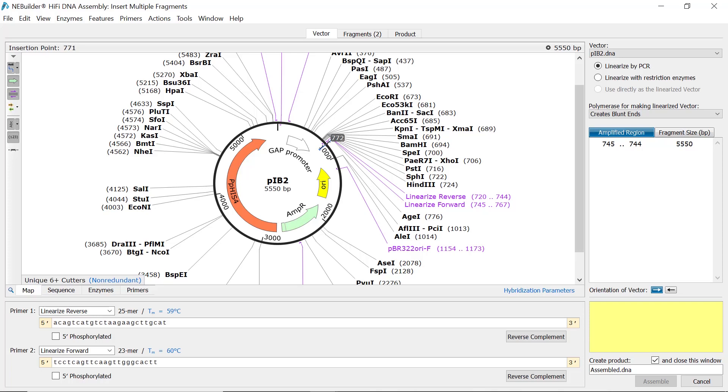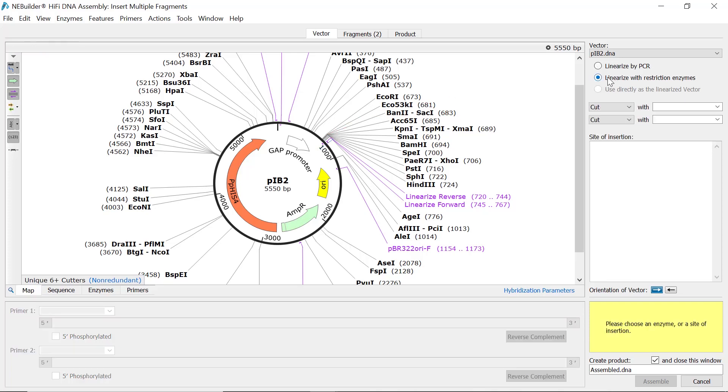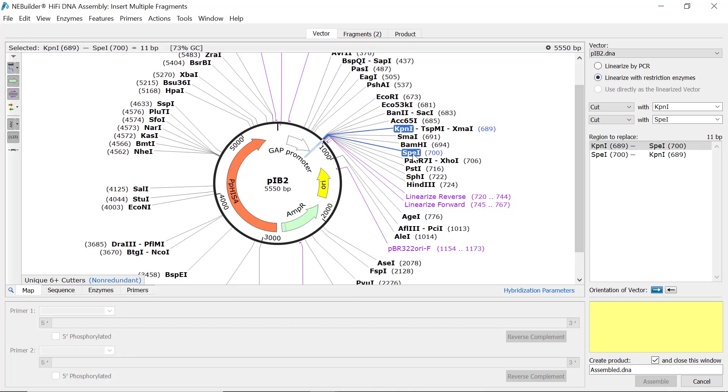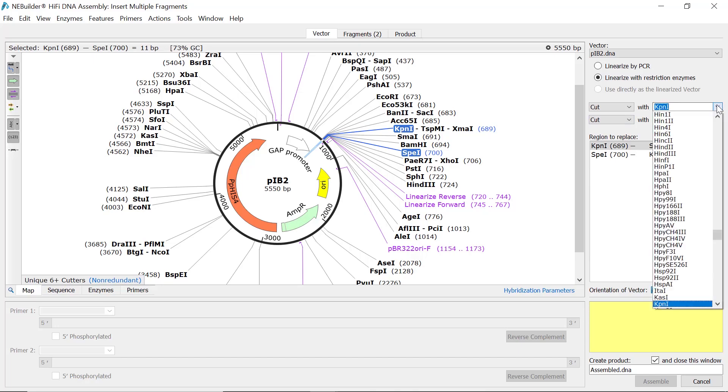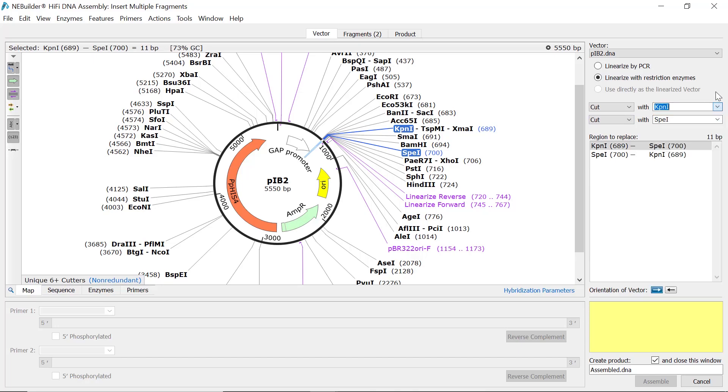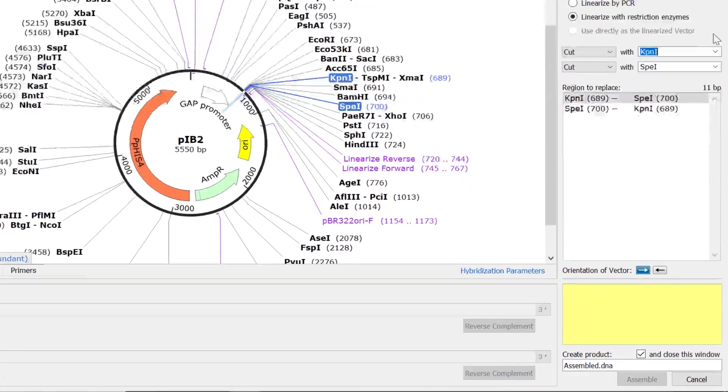Alternatively, to linearize with restriction enzymes, select the linearize with restriction enzymes option and then shift-click on the two restriction enzymes in the map view. You can also use the drop-down menus to specify the enzymes.